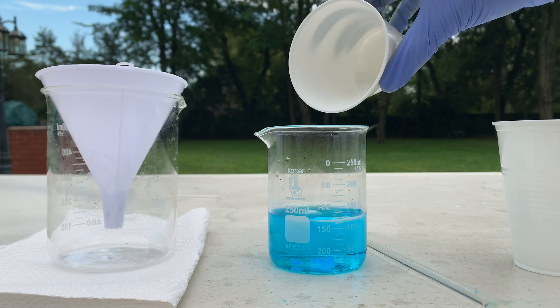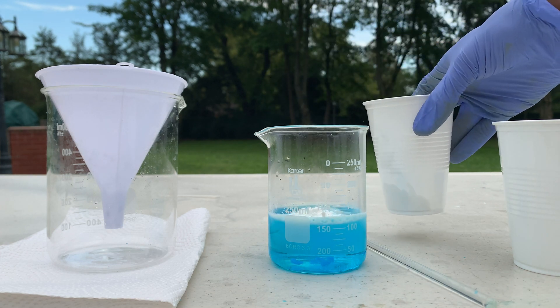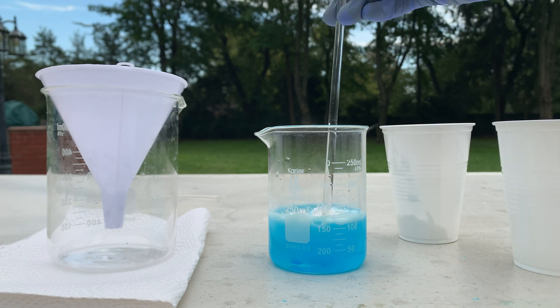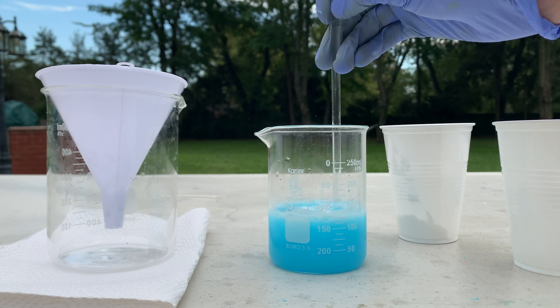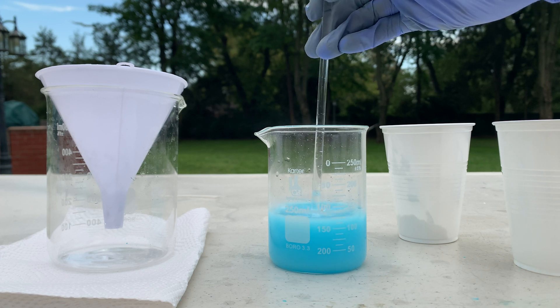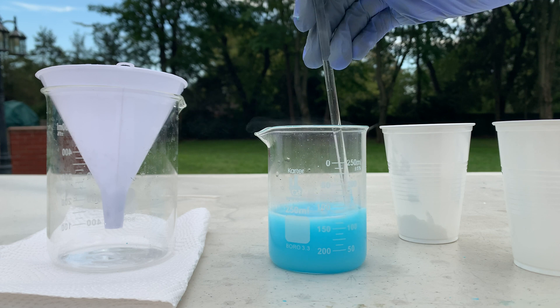Yeah, you can see that it starts fizzing right away. I didn't add all of it yet but I'm just going to mix what I did add. The solution is starting to turn into a light blue — you can see that's the copper carbonate being produced.